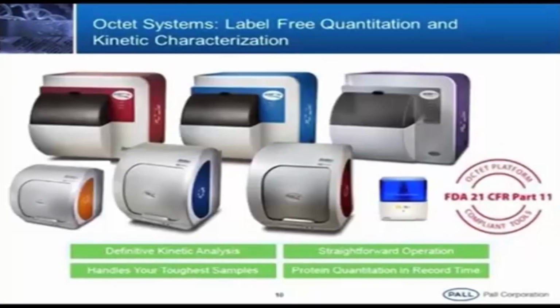And this is the blue model. It has a similar 8 channel function, but this instrument is not useful for small molecule interactions. We can only go from proteins up to megadaltons; small peptides or small molecules are not possible with this. This is the one recently launched, a 2 channel instrument especially for academia. It only takes 2 samples at a time.